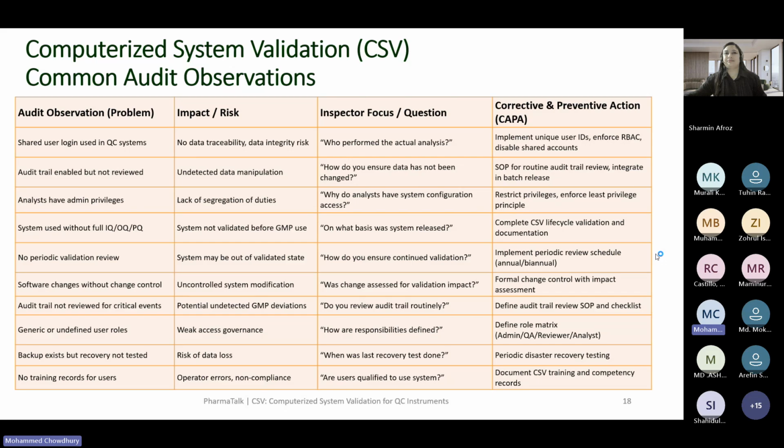We should not predict. We need to validate, and it should be facts and figures. If we can validate through substantial evidence, then we should not predict whether the system will fail or not.